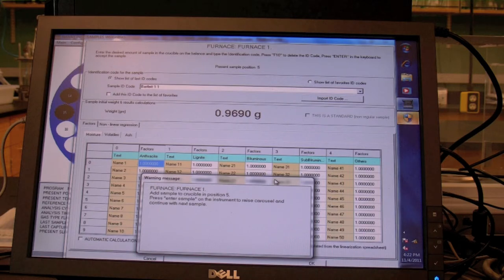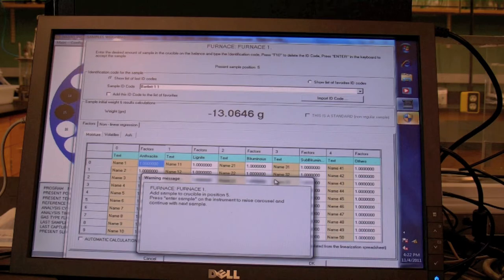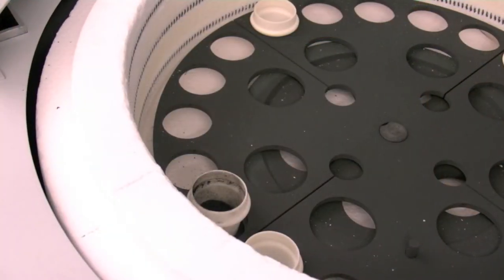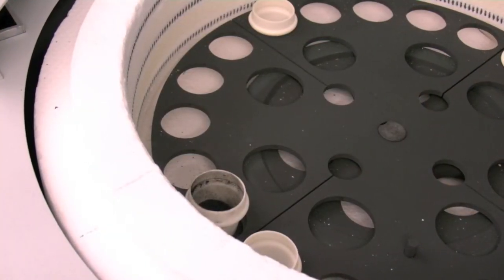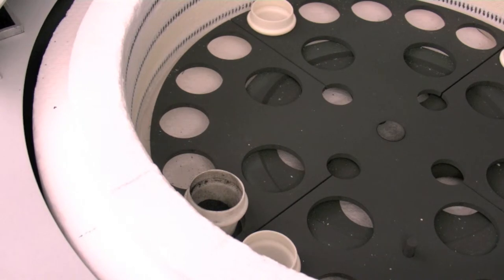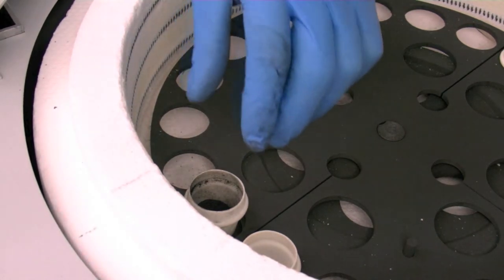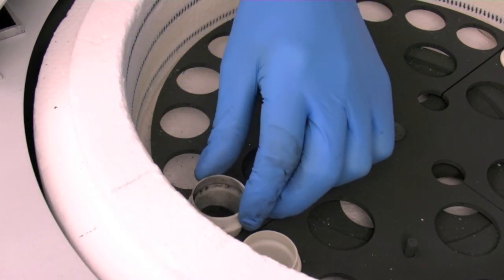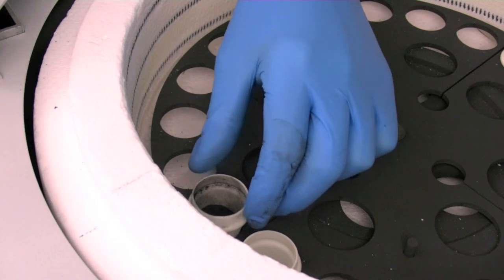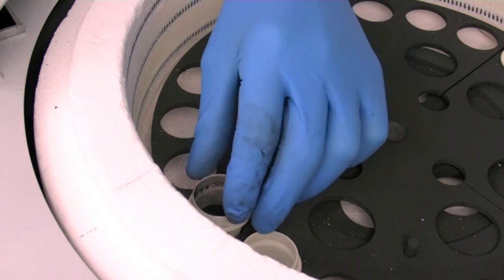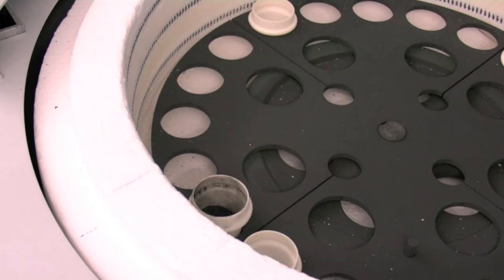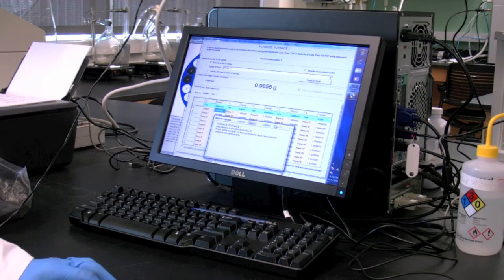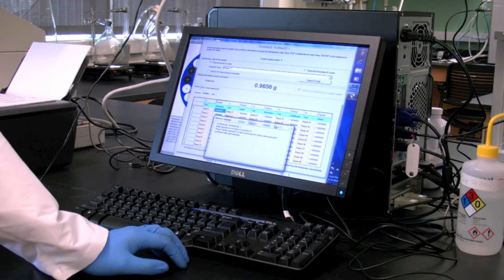Return the crucible to the top position of the pedestal and reweigh. Do not press the red button again yet. If the weight is unreasonable or varying widely, move the crucible around on top of the pedestal so that the sides of the crucible are no longer touching the sides of the carousel. Enter or the red button to continue.